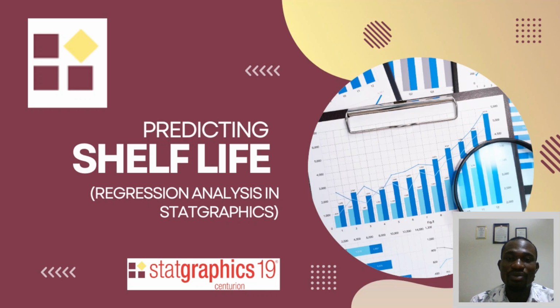So when you look at a product, you can research or find out what parameters normally indicate spoilage in such products. So if it's a dairy product, maybe you can be looking at the pH. Is it going so sour? Is it going so low in terms of pH? And that will reflect in terms of the tanginess of the flavor. So your sensory will correspond to your pH values.